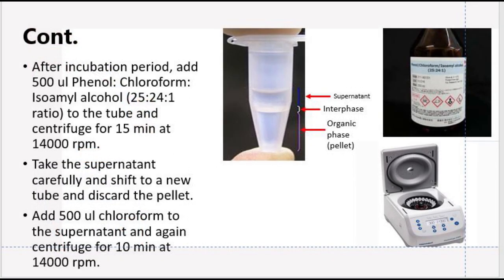After the incubation, add 500 microliter phenol chloroform isoamyl alcohol solution in the eppendorf tube and centrifuge it at 14,000 rpm for 15 minutes.